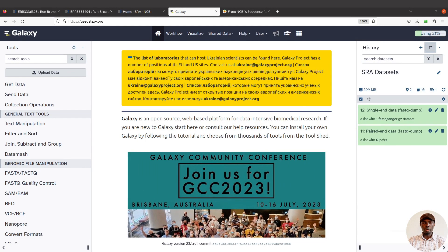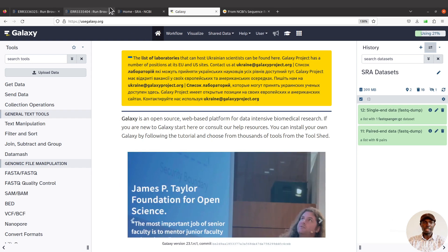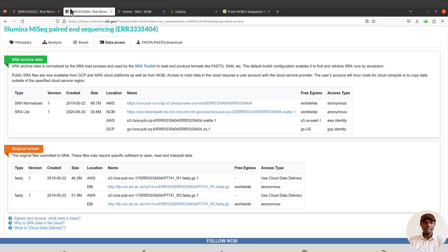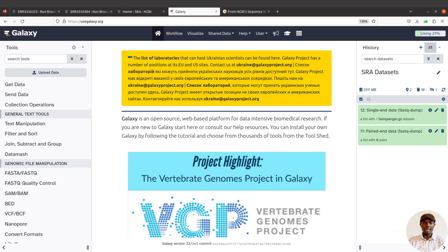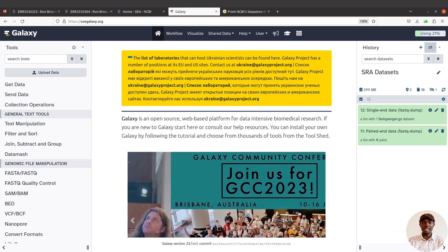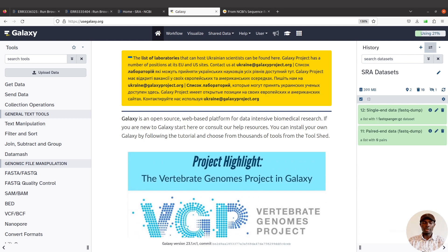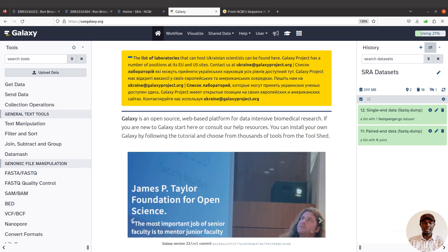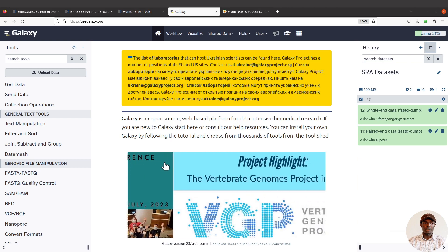Hi everyone, welcome to another episode of the tutorials on Galaxy for bioinformatics. In today's video I'm going to show you how to import data from the SRA database to Galaxy. We are going to look at getting the data in the FASTQ format, covering both single-end and paired-end data. I already have some example data here, but I'll show you how to do it now.